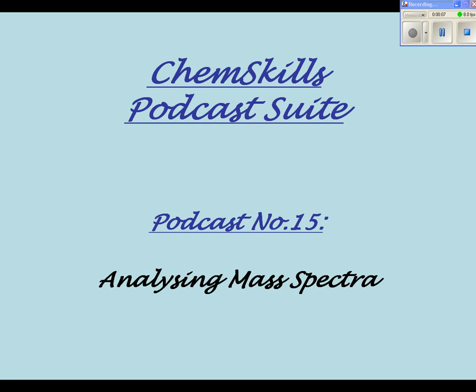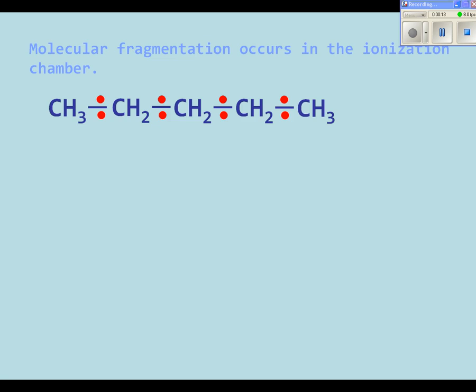This is podcast number 15 in the series, and the topic of this session is analysing mass spectra. As we saw in podcast 14, the mass spectrometer is a device that differentiates between particles on the basis of their mass. The very first stage involves ionisation, and ionisation occurs as a result of electron bombardment.